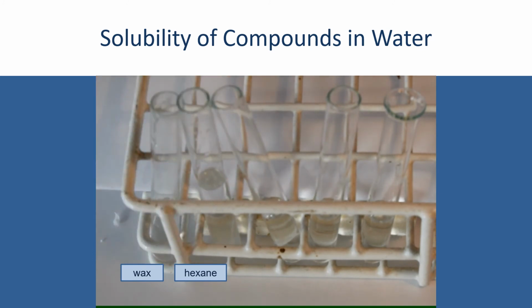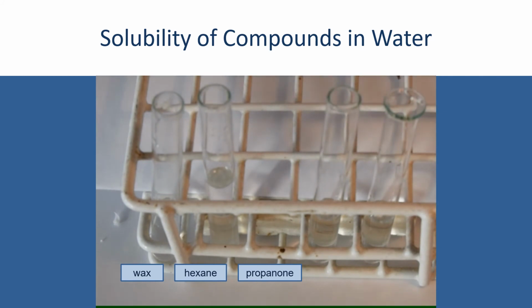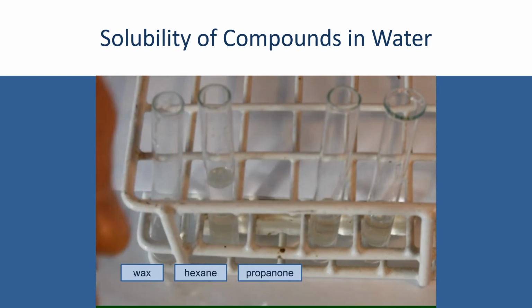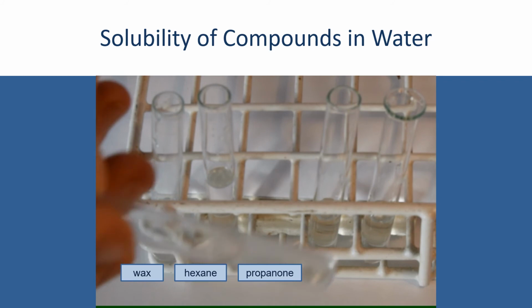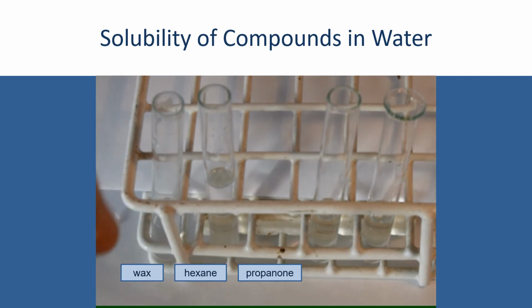Next, I want to look at propanone. Propanone contains permanent dipole-dipole interactions between the molecules. So if I add some propanone to water, and give that a little shake, we can see that the propanone is soluble in water. It's dissolving in the water there.